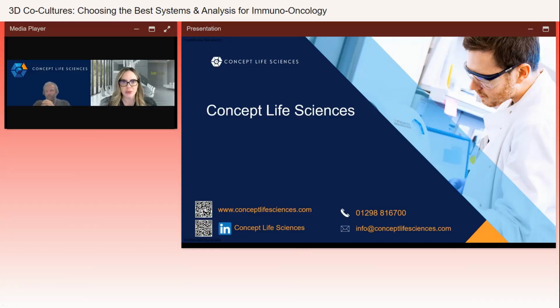Okay, the first question that we have here says, what are the current technical challenges and limitations in integrating iPSC-derived cells into 3D models?